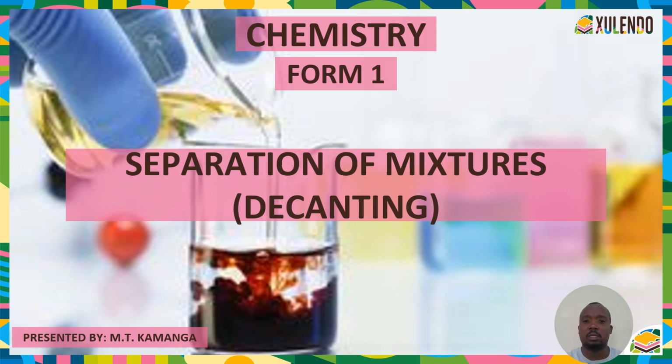Don't worry, because in this lesson, you will see how we can separate a heterogeneous mixture where you have two liquids which are immiscible. They don't dissolve in each other. So we can separate them by a process which is known as decanting. So in this lesson, we'll focus on decanting.